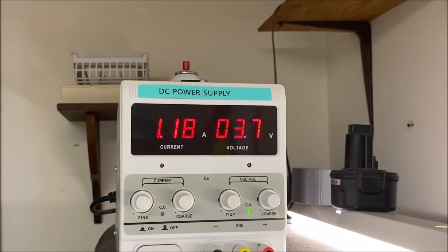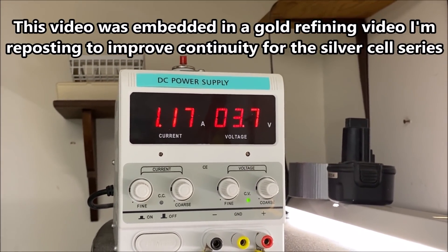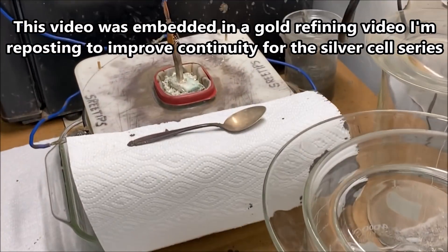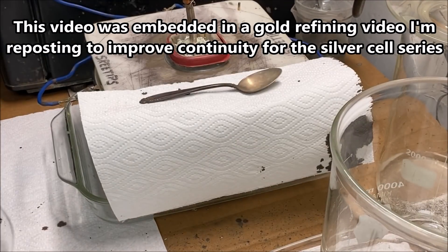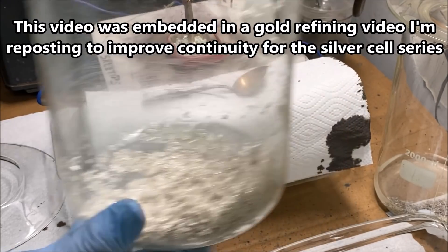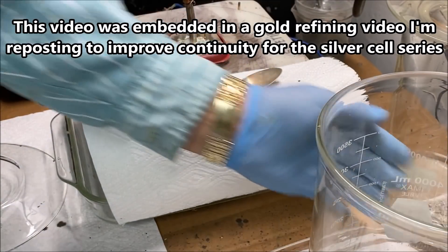I'm shifting gears on you here now. I'm over at the silver cell. This is the power supply for my electrolytic silver cell. This is the impure silver crystal from my last batch, and what I'm doing is I'm running it through the silver cell a second time.